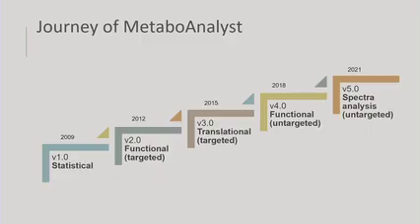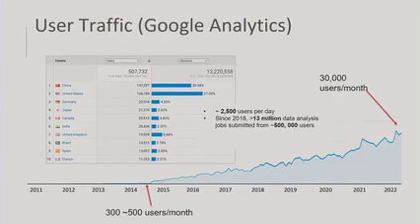Why? Because all the previous questions we tried to address have been solved. Okay, I'm just saying solved. It means method-wise you can continue to improve, but the major bottleneck is solved. But raw data processing and how to do untargeted analysis is still a challenge, so we continue working on it. Actually, we are going to release version 6 soon, and we are doing MS2. We are going to talk in slightly more detail later. So this is continuing the effort. It's being used widely, and hopefully will be used more in the future.